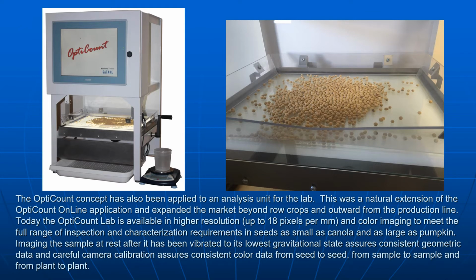We followed almost immediately with the OptiCount Lab, the smaller and less expensive benchtop version. It has been configured to analyze corn and soy, but also everything from canola and a wide range of veg seeds to edible sunflower kernels to plastic pellets.